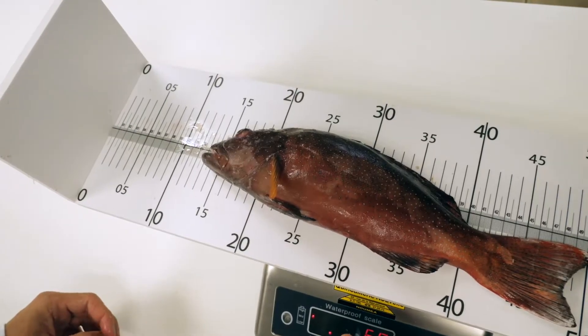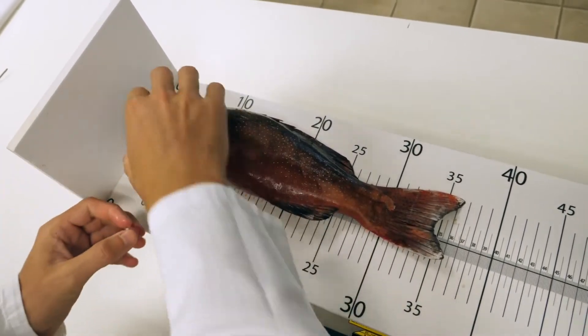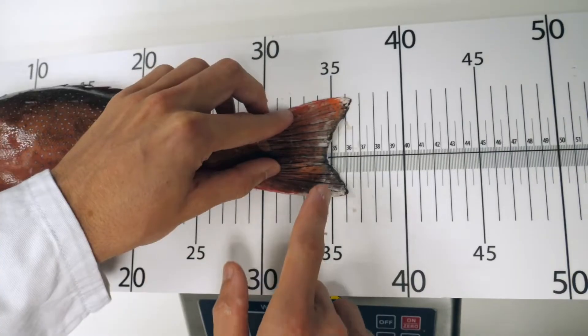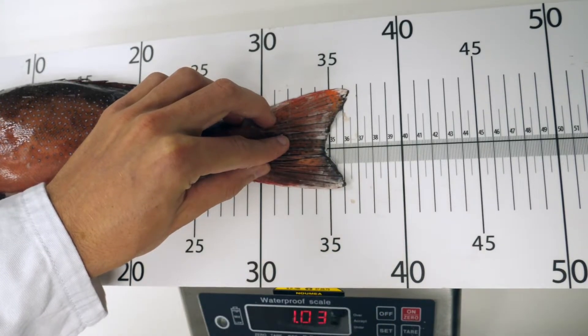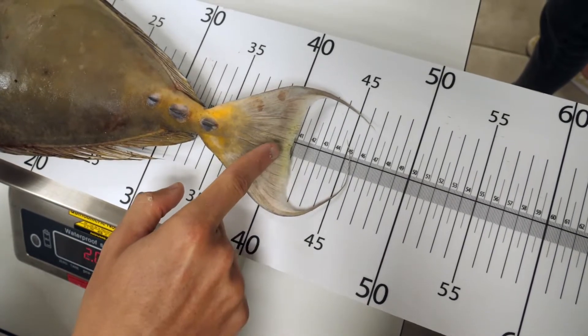Measure the fish from the mouth to the fork of the tail. To do that, close the fish's mouth aligned at zero and align the fish to the scale marking. That's it! All you have to do now is read the measurement at the fork of the tail for fish with a forked tail, and at the tip of the tail for others.